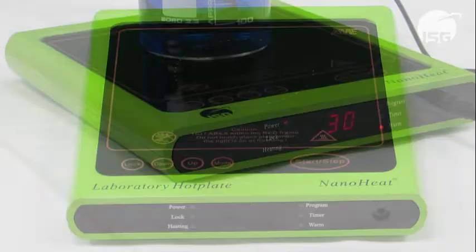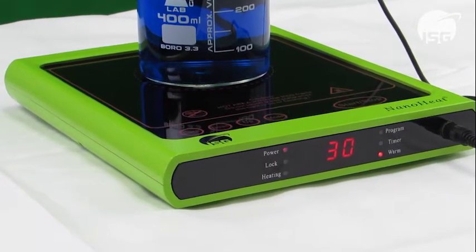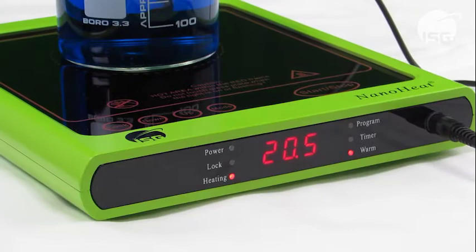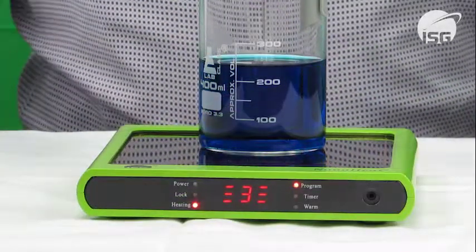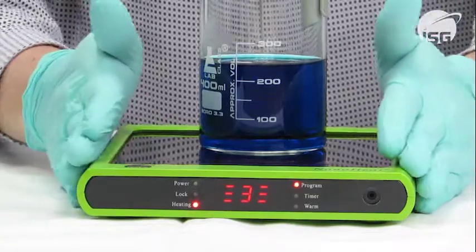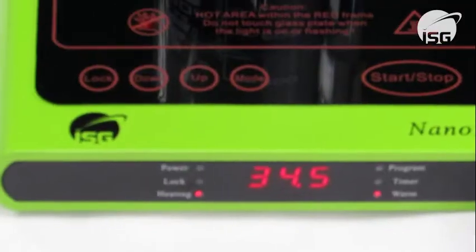The ISG NanoHeat Hotplate is a compact, high-powered unit featuring a unique heating technology which enables the hotplate to heat to 300°C in under a minute. The hotplate has an insulated casing to prevent it from getting hot during use, increasing the safety of the user.